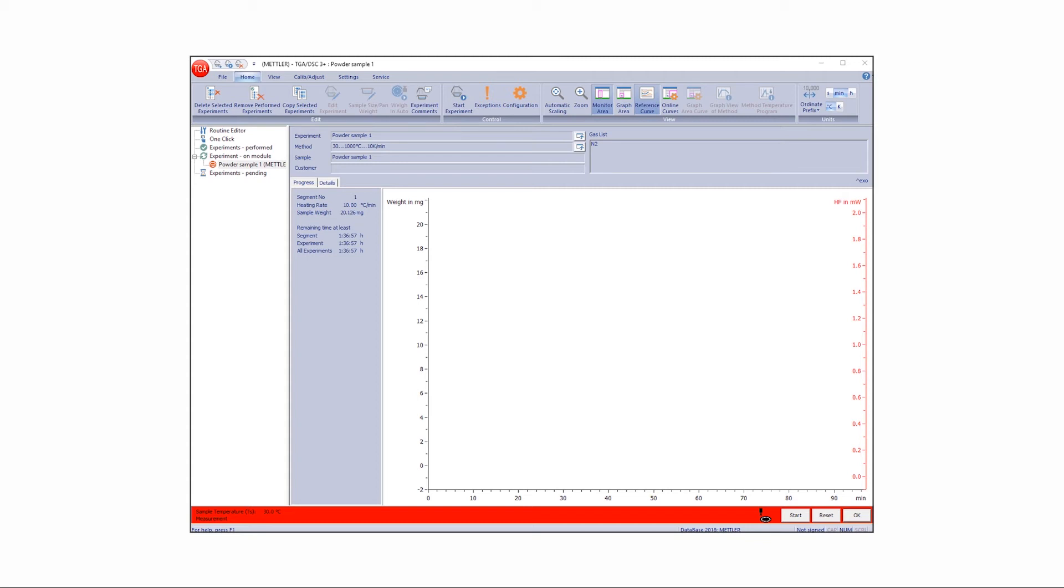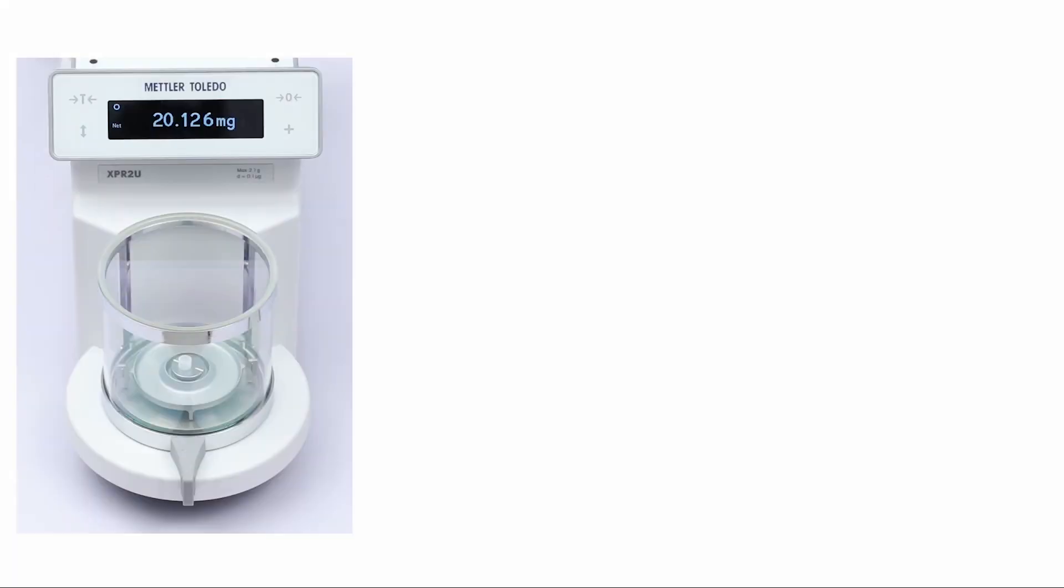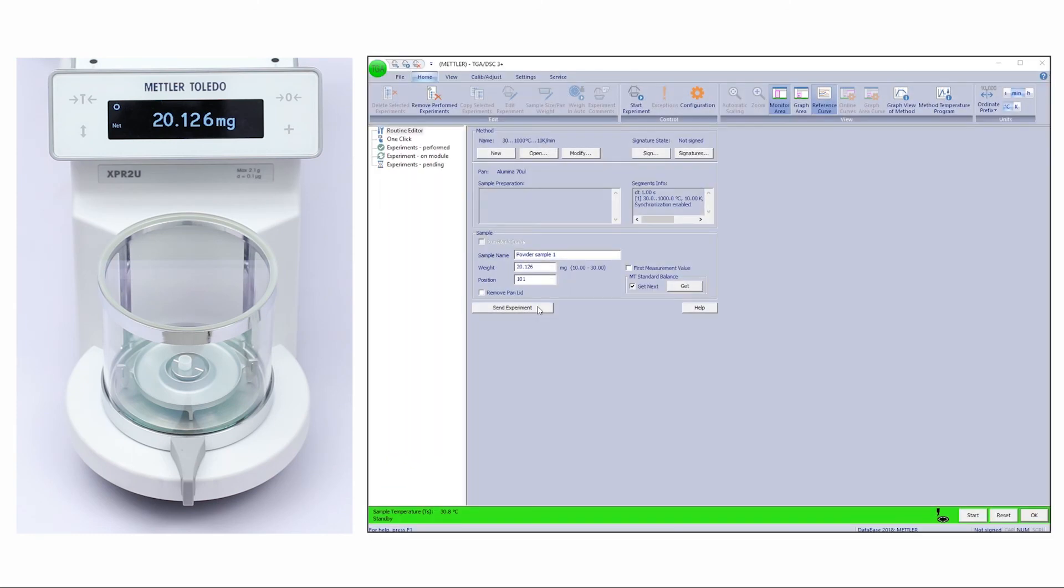We have demonstrated how you can easily transfer TGA weight values from an external balance directly into STAR-E software.